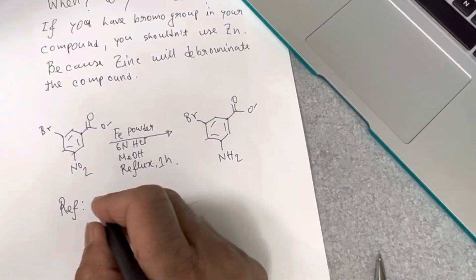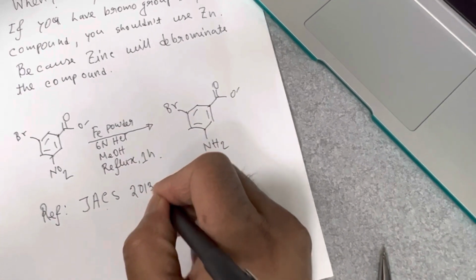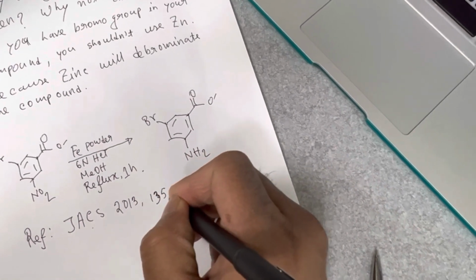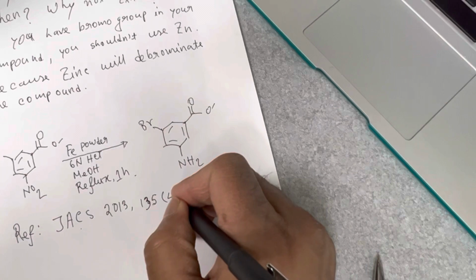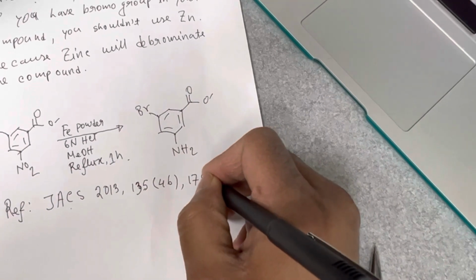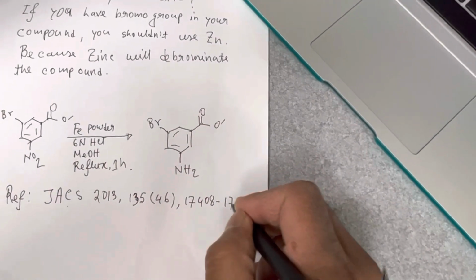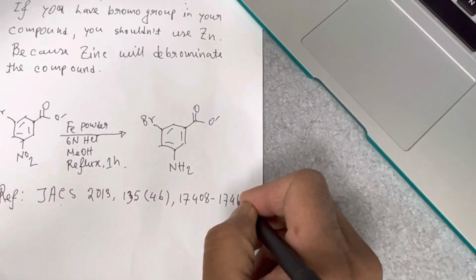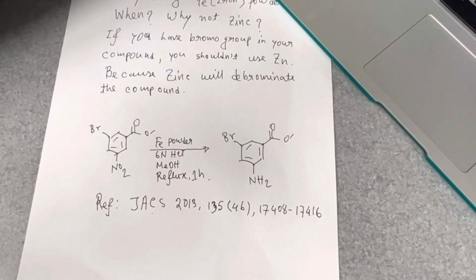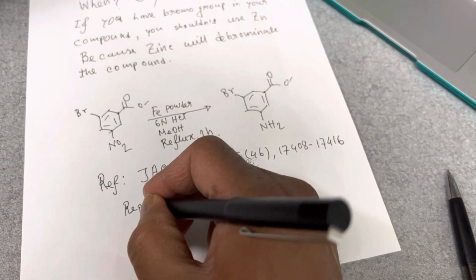So here I'm showing also the reference paper. It is Journal of American Chemical Society, or JACS 2013, volume number 135, issue 46, and page number 17416. They reported the yield is 92%, and I have done this reaction and I got 94%, almost the same.